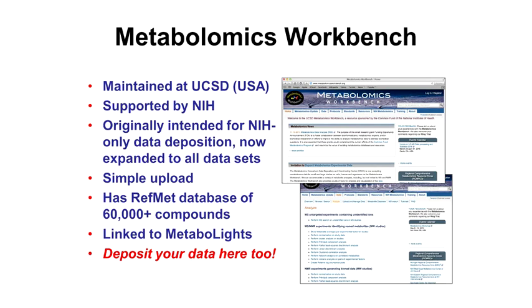It also has a number of other tools, like a reference metabolite database, which is really just the HMDB. And it's linked to MetaboLights, the database at the EBI. So you have several choices in terms of uploading your NMR-based metabolomic data. You can upload it currently in several different formats, but as I say, the trend, the strong push, is to try and get everyone to adopt the NMR-ML format.